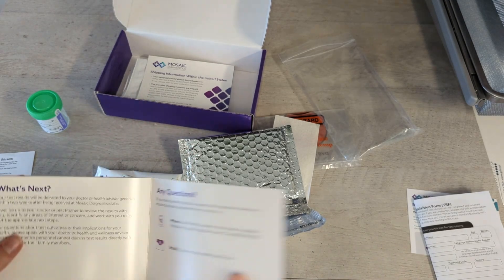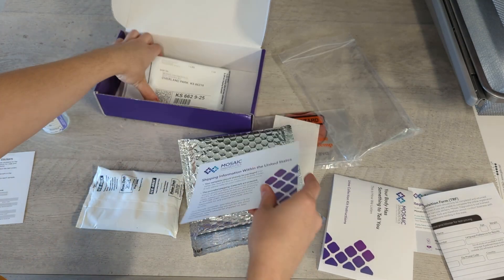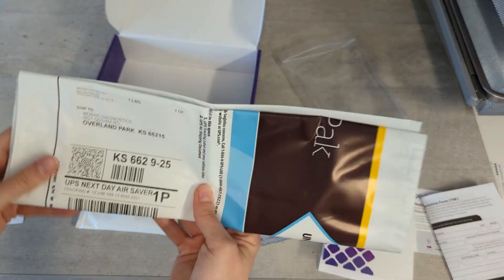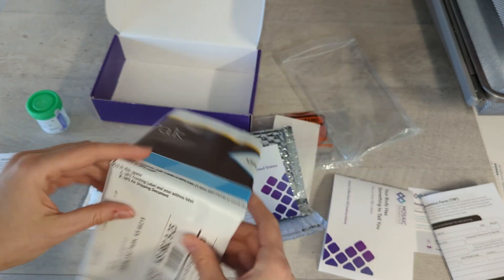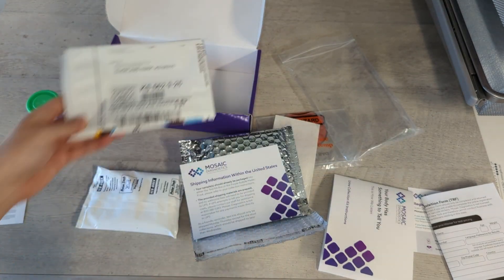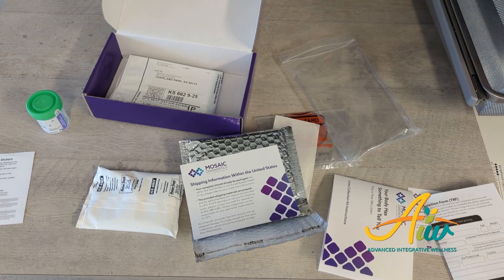And that is about it — it's a pretty straightforward test. The only other thing in here is some shipping information, and you've got your prepaid label with UPS. Any UPS location can take this package. Please avoid shipping it on a Friday or after so it doesn't sit in a warehouse over the weekend. If you have any questions about this test kit, please don't hesitate to reach out to our office.